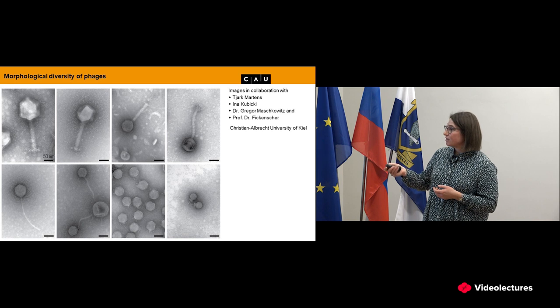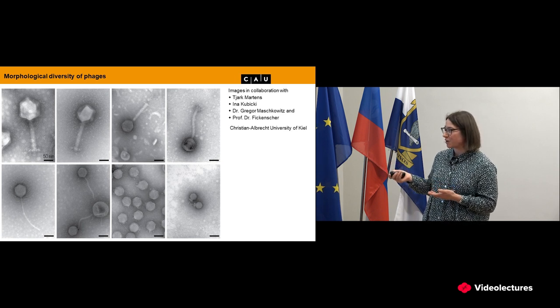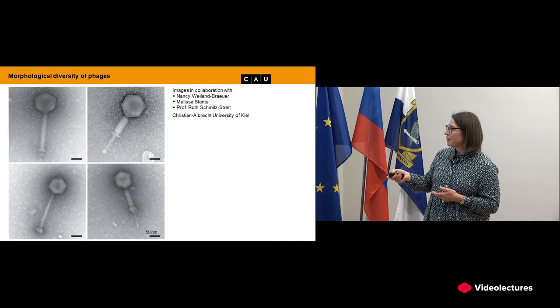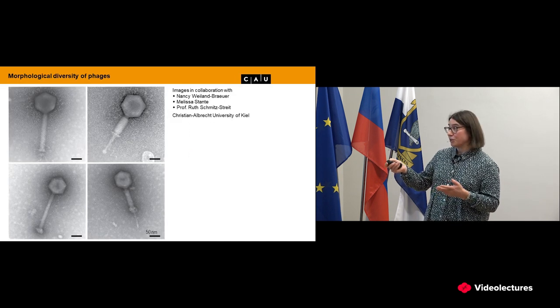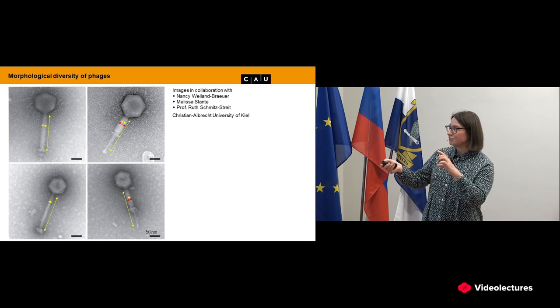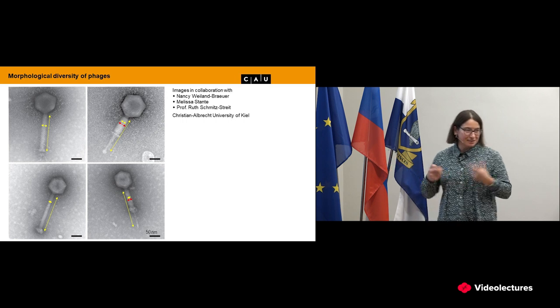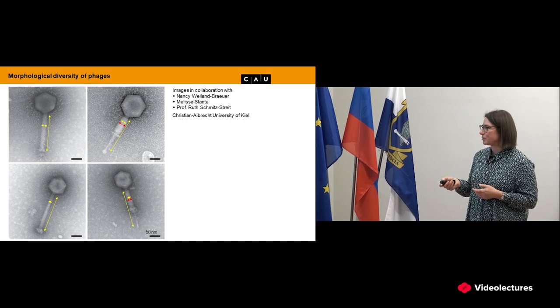So when everything is nice, we see a lot of different shapes. Be careful, the scale bar is just 50 nanometers. So these are very, very small particles, and we already see a lot of interesting structures. And so we know that some phages have contractile tails. So here, when the sheath contracts, we actually see that it is shorter. This stays more or less the same, but this thick part is shorter and it thickens in its diameter. So already with the simple technique, this preparation takes 10 minutes, we can observe so many details.